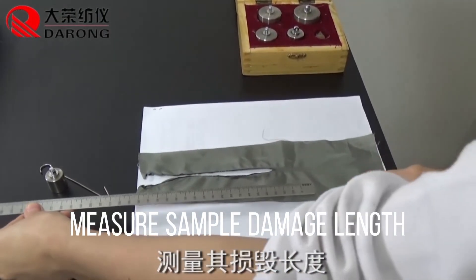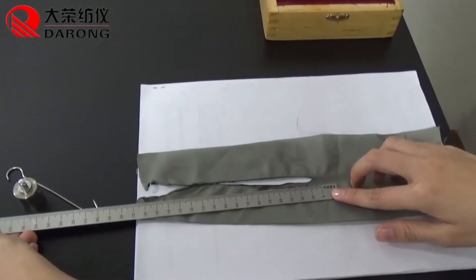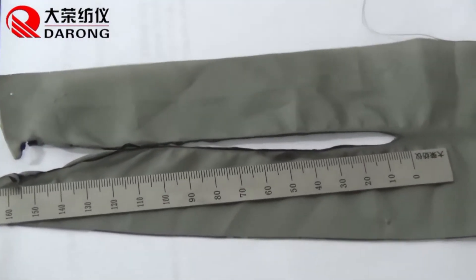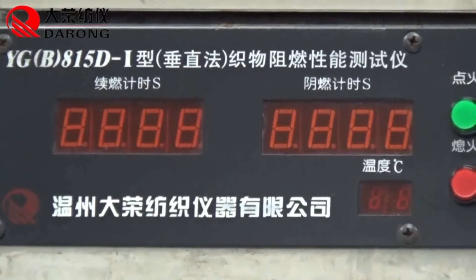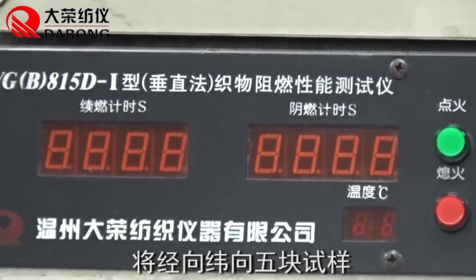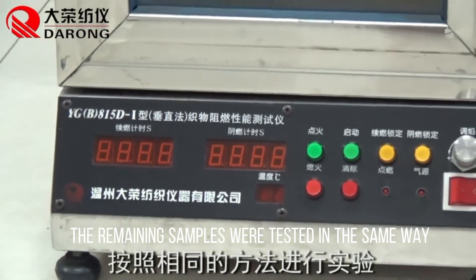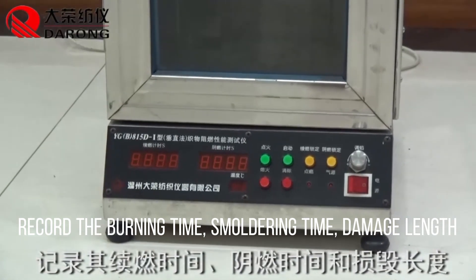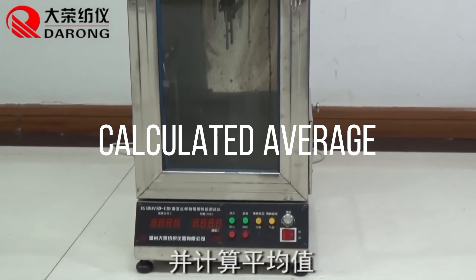Measure the sample char image length. The remaining samples are tested in the same way. Record the burning time, smoldering time, and char length. Select and calculate the averages.